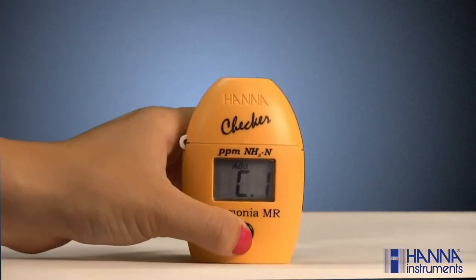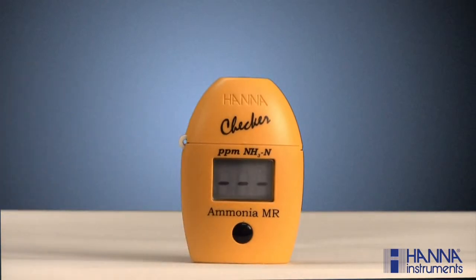Press the button. The meter is now determining our blank value, which is the absorbance from our unreacted sample. This is done to correct for any absorbance which may be inherently present in the sample. When C2-add appears with "press" blinking in the right-hand corner, the sample has been successfully zeroed.